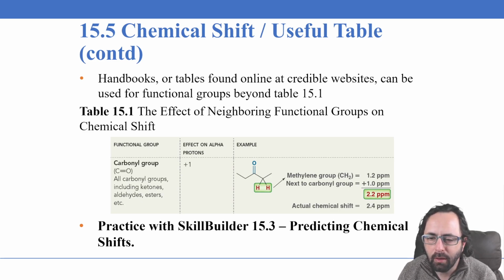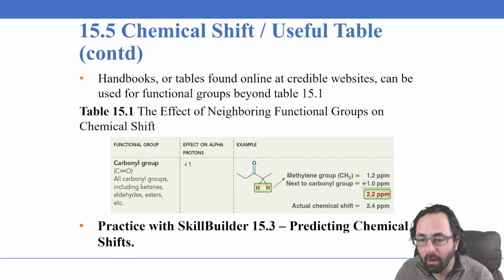Last time in our lecture we discussed the principles behind the way the nuclear magnetic resonance spectrometer worked, and we started to discuss some of the important factors in analyzing a spectrum that comes from performing nuclear magnetic resonance spectroscopy on a particular organic sample.